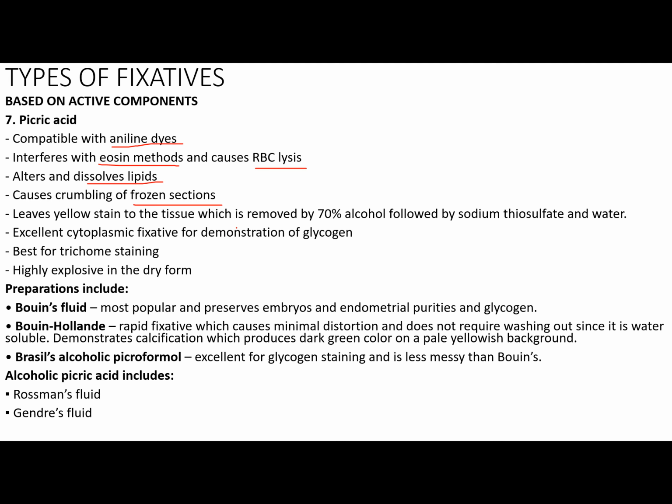Leaves yellow stain to the tissue which is removed by 70% alcohol, followed by sodium thiosulfate and water. Excellent cytoplasmic fixative for demonstration of glycogen. Best for trichrome staining. Highly explosive in its dry form. So when picric acid is in powder form or dry form, it is highly explosive.